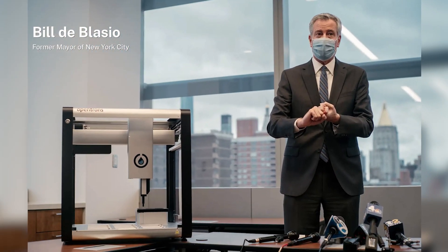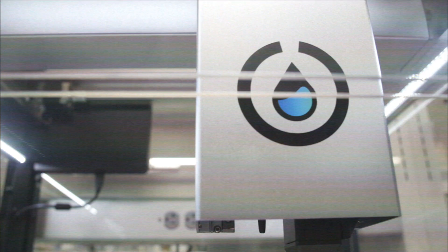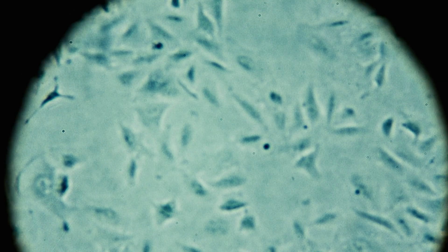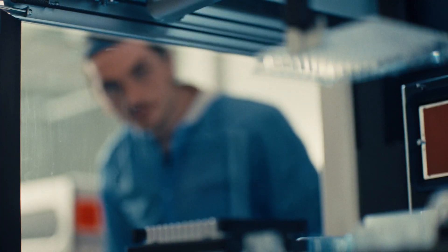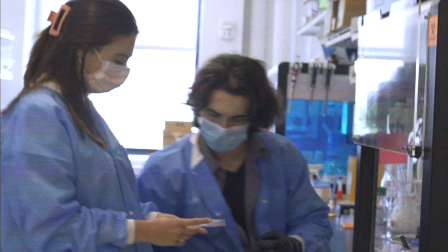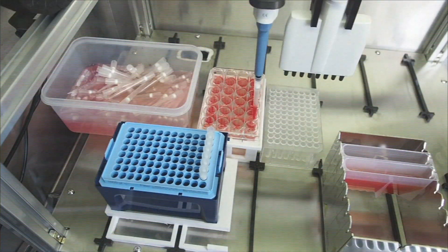At Opentrons we've had the opportunity and privilege to empower researchers and communities around the world. We see this remarkable opportunity to enable lab automation for the first time to be accessible, user-friendly, and really built for the scientists in mind.